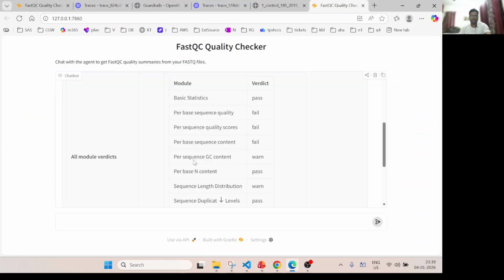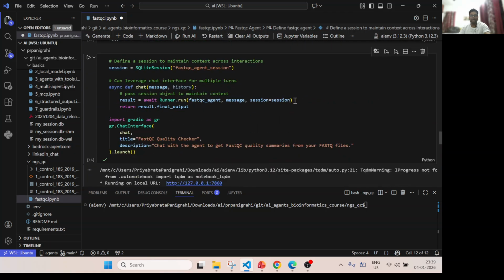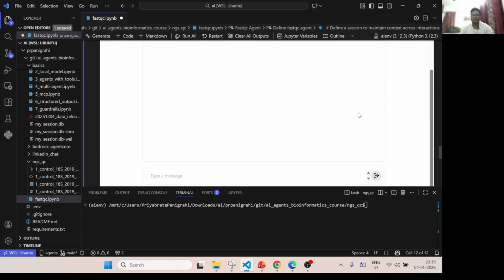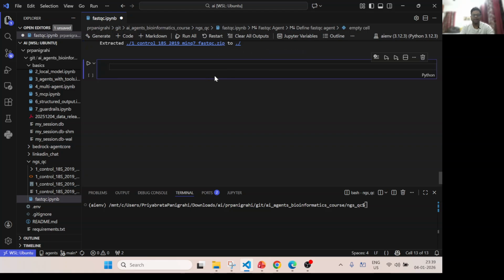So instead of writing the code directly here, as a one liner, I will just tell you the prototype of how we can do it. Let me show you. Maybe in the next one, I don't have that use case ready yet, but you can say, first call FastQC.